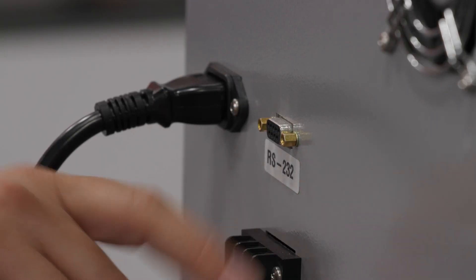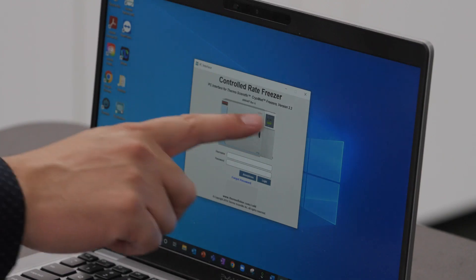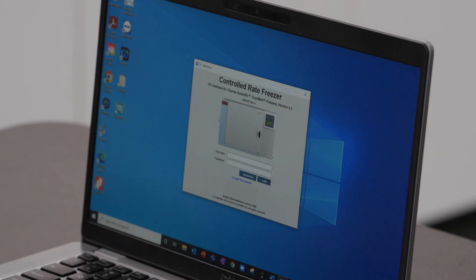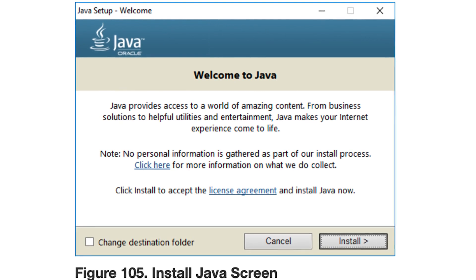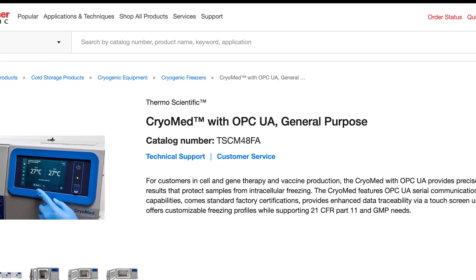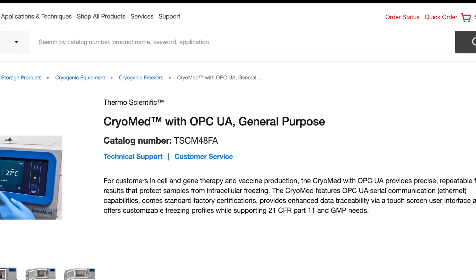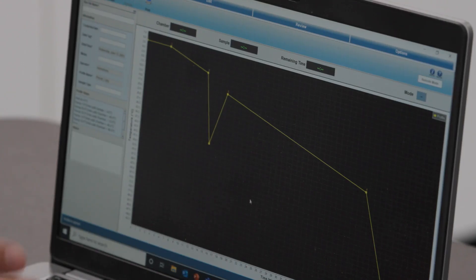Connect a dedicated PC using the included RS-232 extension cable with a USB to serial adapter. Install PC Interface Version 3.3 with the accompanying Java 1.8 build provided in the packing list, or you can go directly to the Cryomed product page on thermofisher.com to download a zip file for installation. Once you verify the COM port with the unit turned on, you can create a username and password using the requirements for both, allowing full access to the software features.